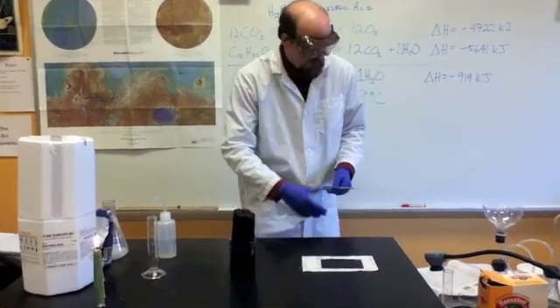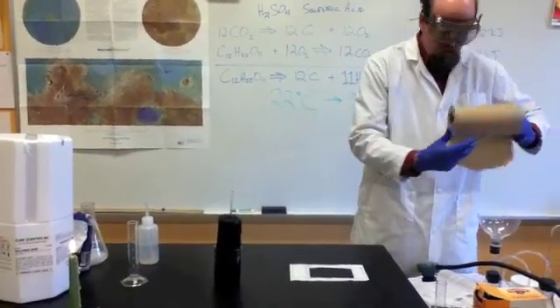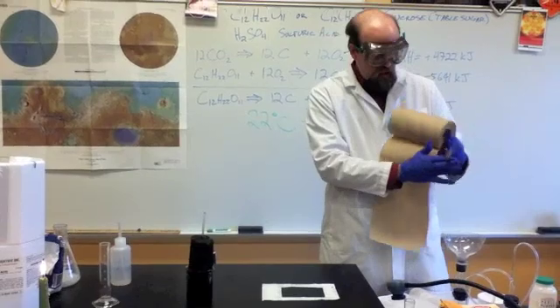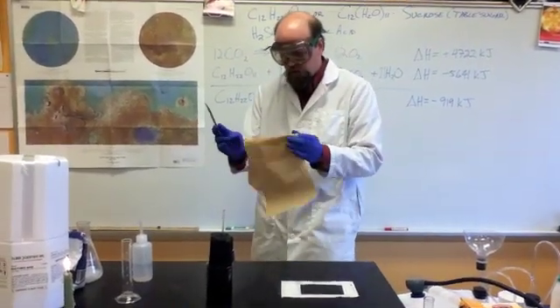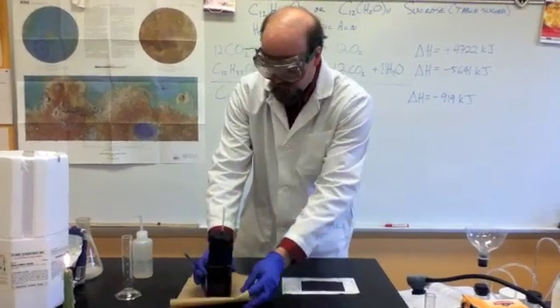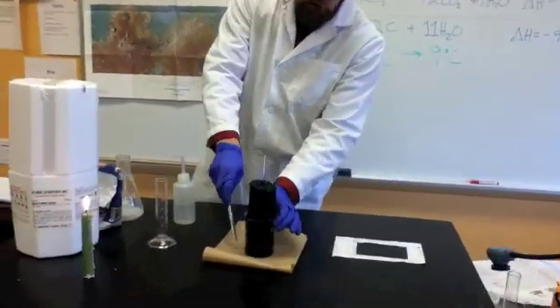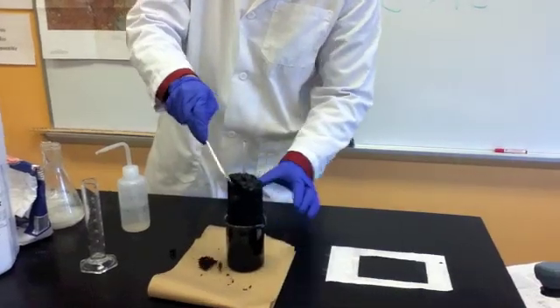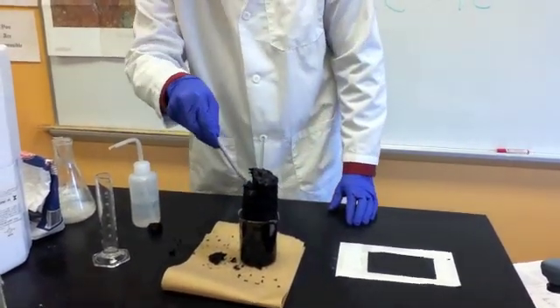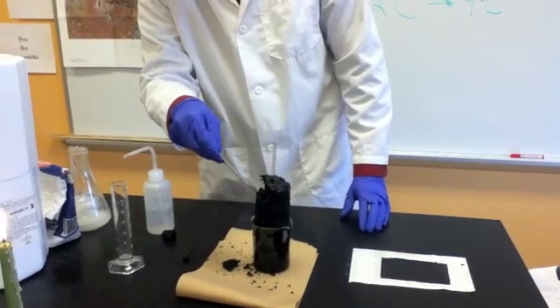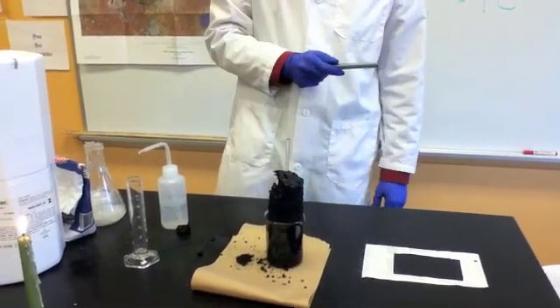As one final thing, I want to show you just how fragile this stuff is. Each of the sugar grains was separate and there was no reason for them to really stick together. This is very hot now. So the material itself is actually pretty fragile. You can break it right up. You don't want to pick it up with your bare hands because it still has quite a lot of residue from the sulfuric acid on it.